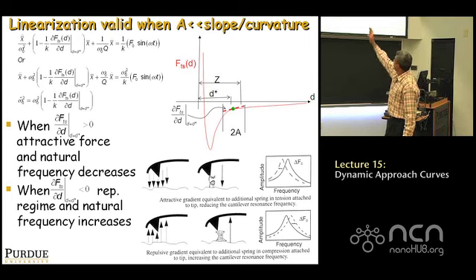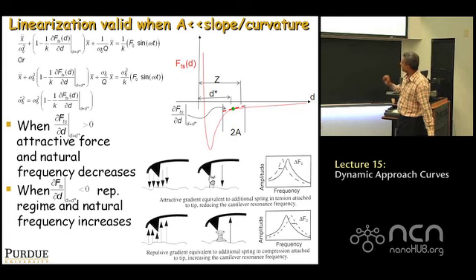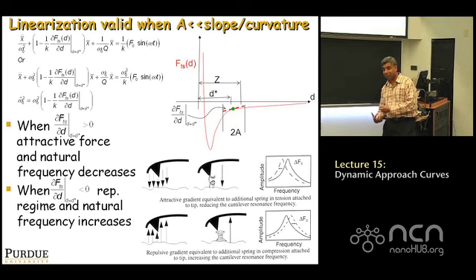And when you're to the right of the minimum point, the spring is something like what's called an attractive spring. It's a spring that is sucking the cantilever in. Most springs we're used to are repulsive, right, in that they restore. But you can think of negative springs that, as you push, they pull further down, you know? That's what it is.